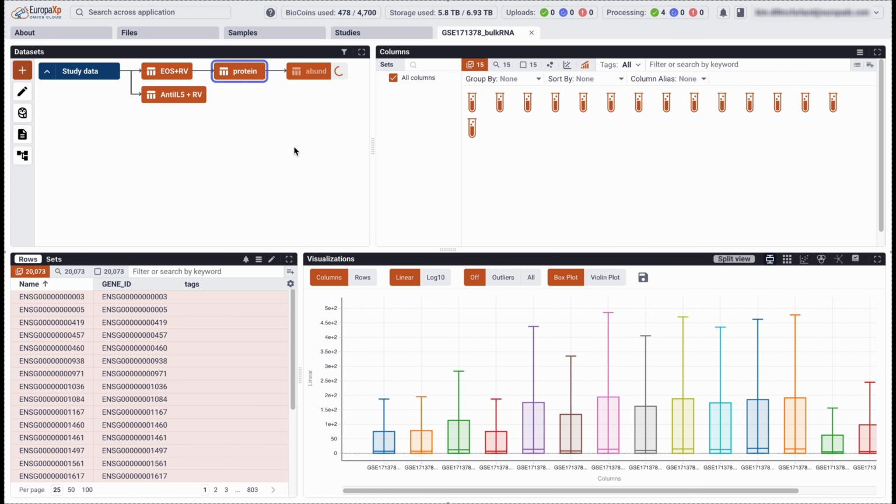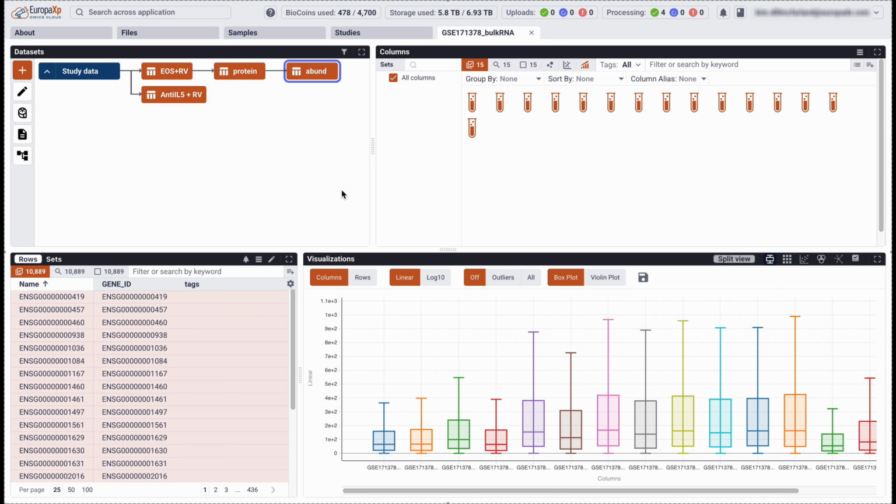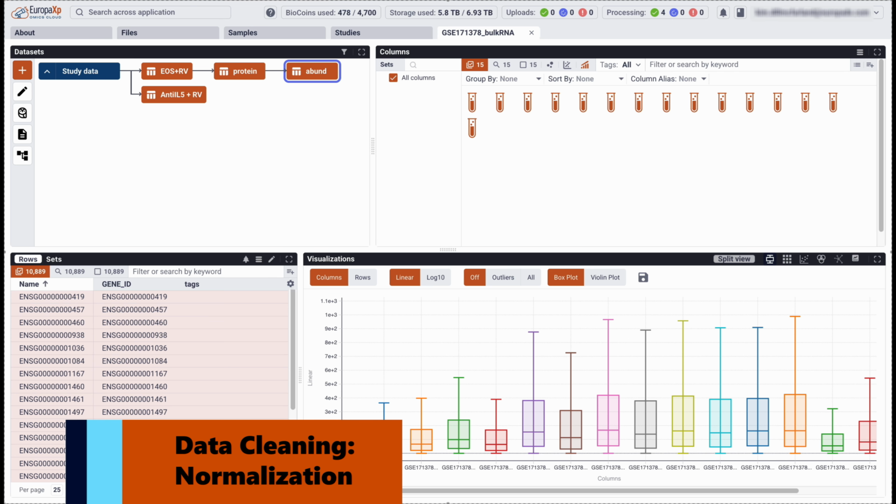Looking at our abundance filtered data, you can see that the scale and look of the box plots significantly changed as we removed many of the zeros. Here, our medians are above 0 and our box plots have both whiskers showing distributions. Let's move on to data normalization next.